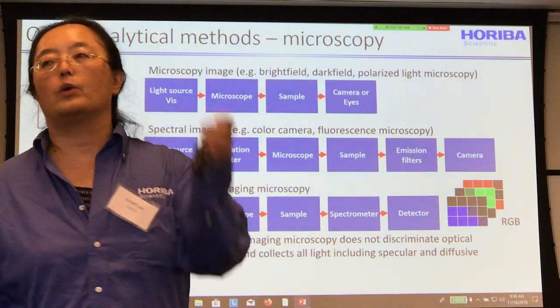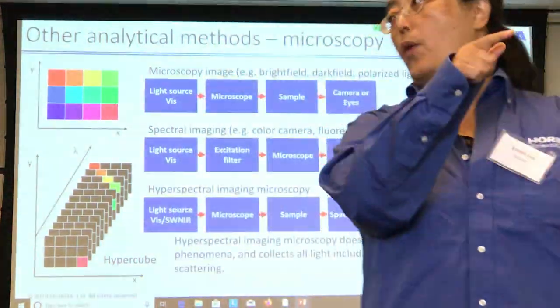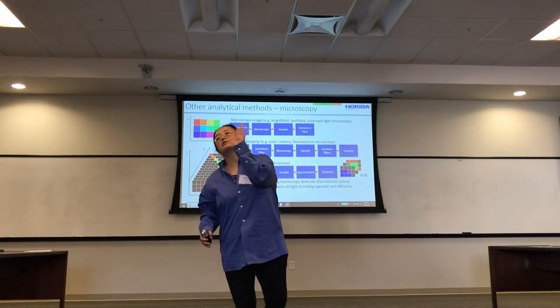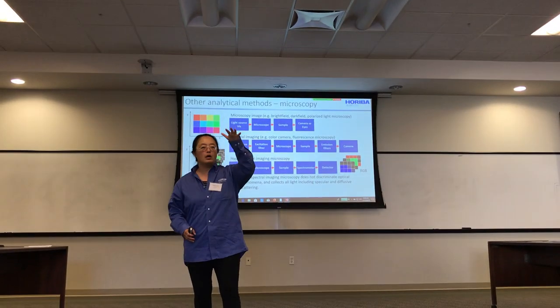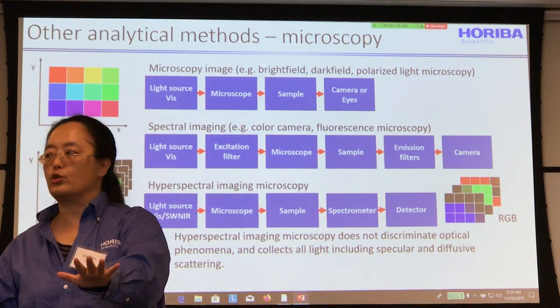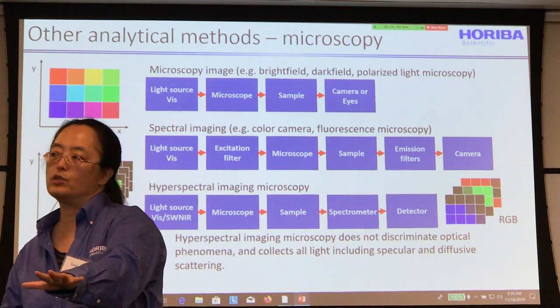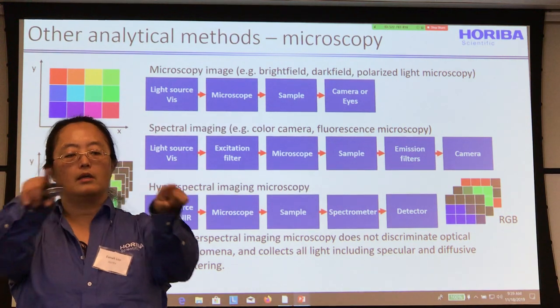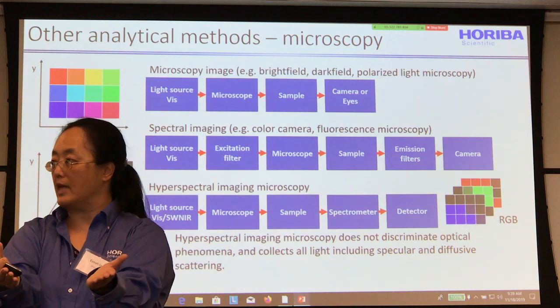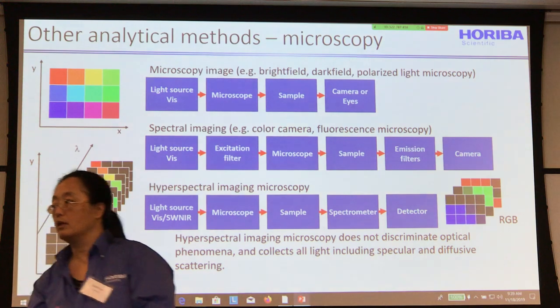Now, there is something called dark field microscopy, which you will use, at least for Raman, this week. When you have a bright field microscope, no matter how well you do the alignment, the center usually is very bright. So what they do is block the center, so you get oblique illumination coming from the side. That's dark field microscopy. So we are gonna try that this way, okay?